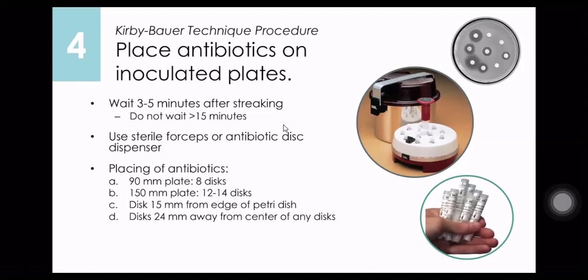Okay? So if there is a delay in giving the antibiotics, it causes false resistance. Sorry, excuse me. Okay, so if there is a delay of 15 minutes before the discs are applied, there is false resistance.